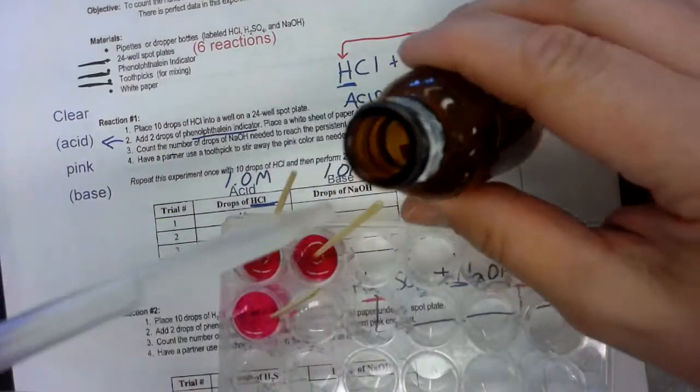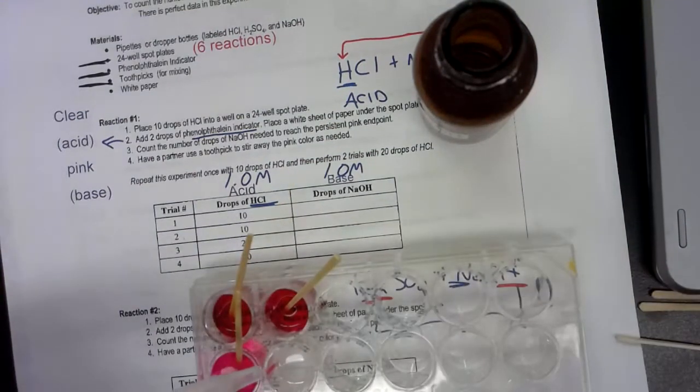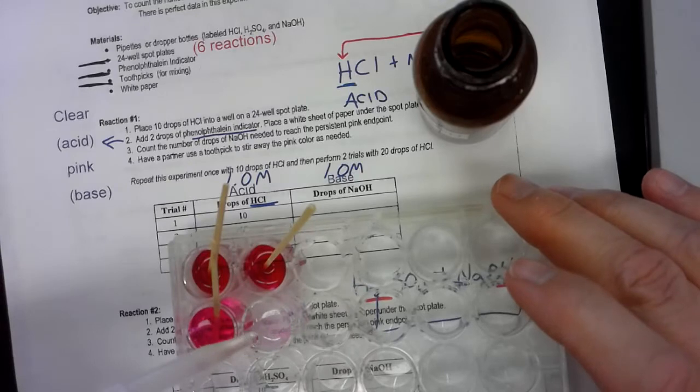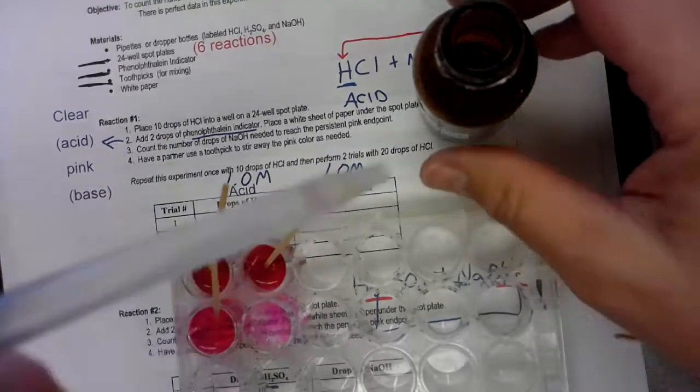Let's go ahead and put in the drops for the next one. So we had 14 and 14, and this is 29. It might have been 30 because I had an extra drop, I think, in there, but go ahead. We have 1, 2, 3, 4, 5, 6, 7, 8, 9, 10, 11, 12. So we have 12 in there.